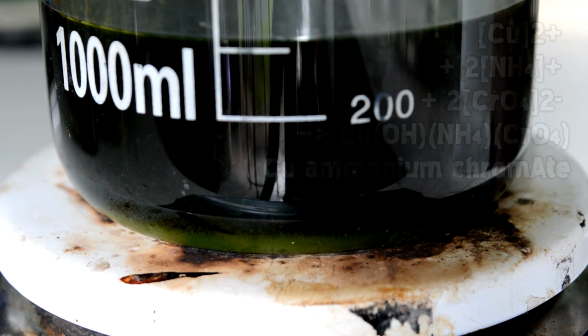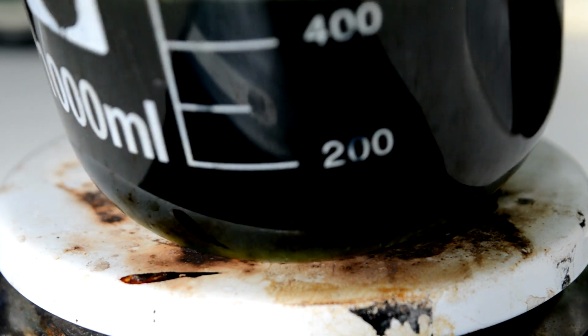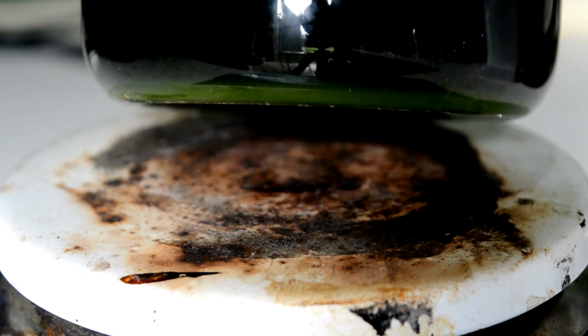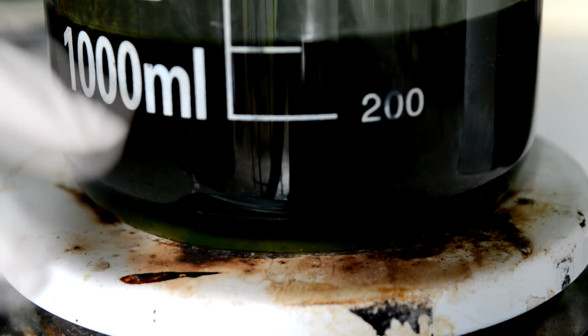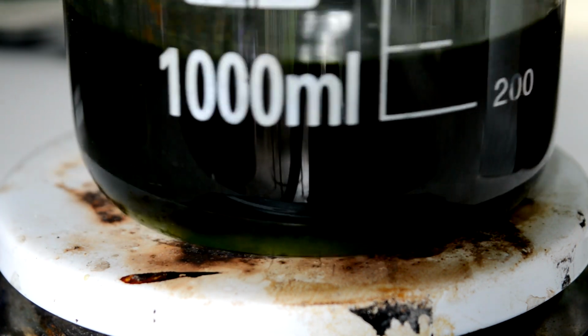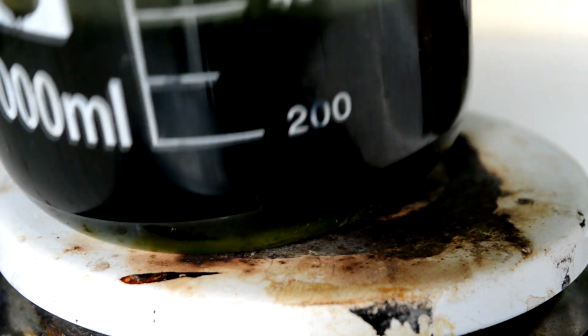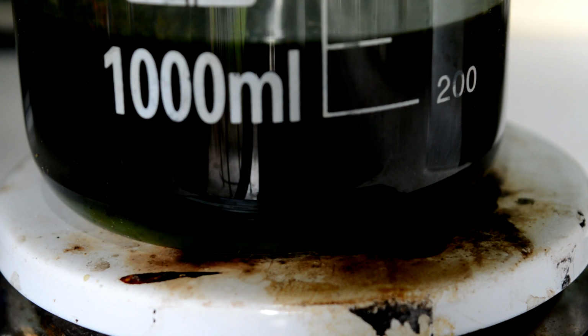So we have some precipitate collecting at the bottom here, but it is definitely the wrong colour. It is bright green, and we should hopefully be seeing some red stuff. So that tells me we don't quite have enough chromium in here. There are hints of it, like here, that's the right colour. So we're just going to try and add some more chromic acid. Hopefully that kicks it into gear a little bit better.